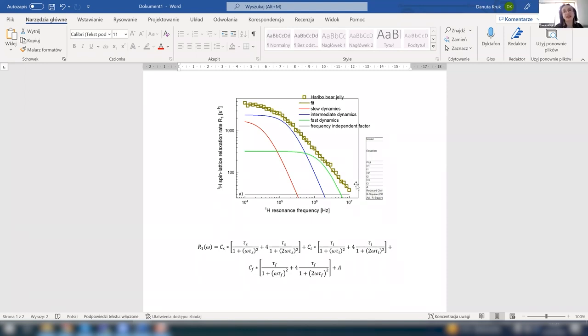Yes, because here it's not like I can remove one. Whatever frequency I take, really all of them are relevant. I mean, you can say that in this frequency range, I could in principle neglect this one. Hardly, but let's assume that I could. However, then it must be consistent over the whole frequency range. So then I go here, and then I desperately need this component. However, this approach really does not give us any deep insight into the mechanism of motion.